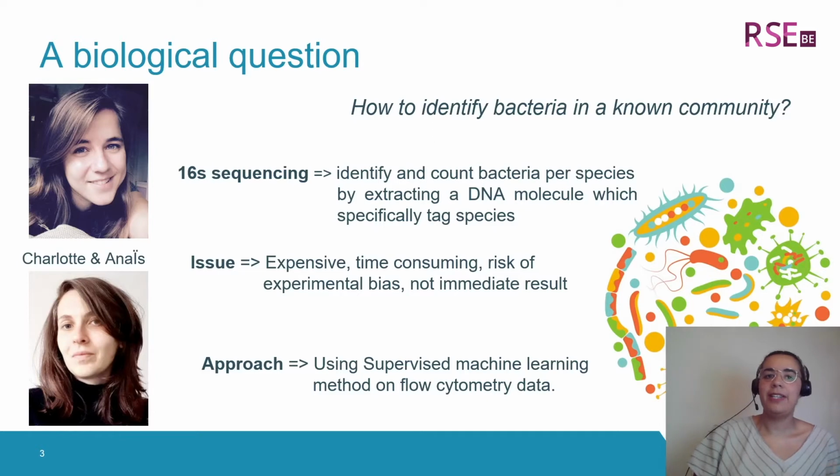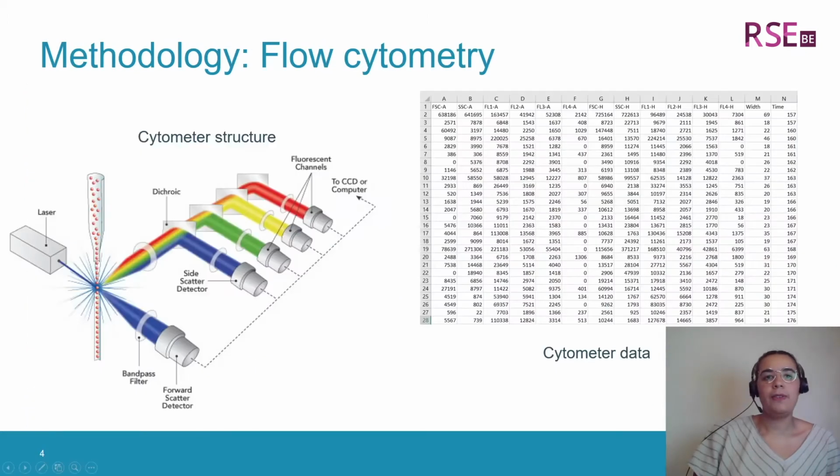But recently, machine learning methods have been applied to flow cytometry data to identify species. So we decided to use it in our case. So first, what is flow cytometry?